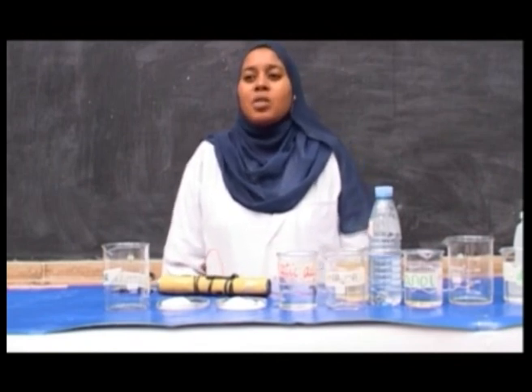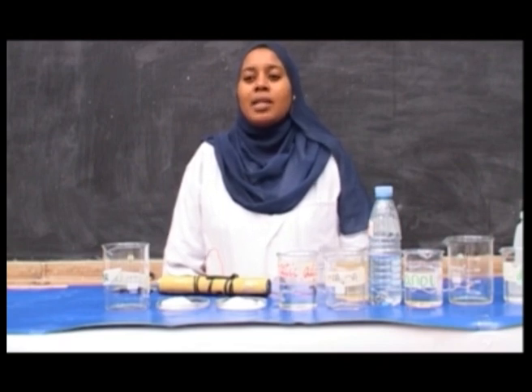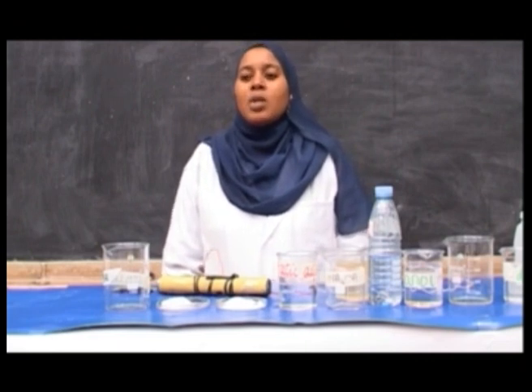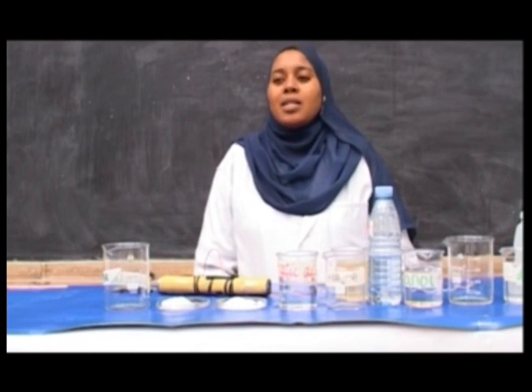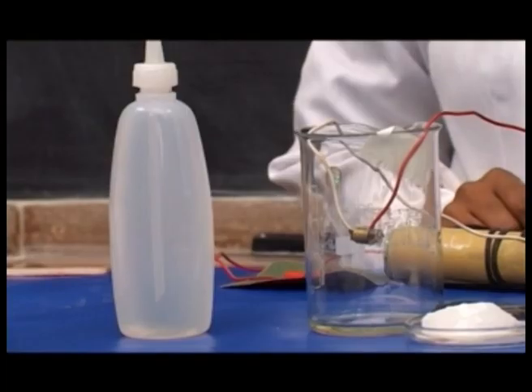Those substances which conduct electricity well are called strong electrolytes. Those which conduct poorly are called weak electrolytes. Those which do not conduct at all are called non-electrolytes. The aim of this experiment is to identify strong electrolytes, weak electrolytes, and non-electrolytes.